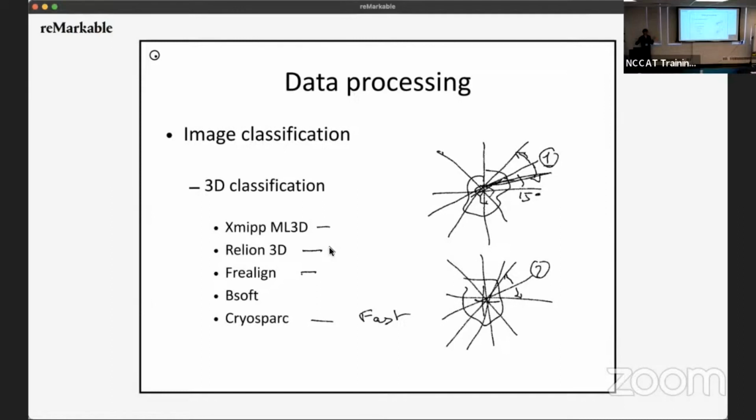That's a case where RELION is very good, because you can say, I'm only looking at 1 degree, plus or minus 5 or 10, I can mask and look at a very local region and do a very careful classification, all the way down to looking at one helix pitching a little bit in gamma secretase. You can see that in Scheres's paper on signal subtraction. So you can go very, very, very local.